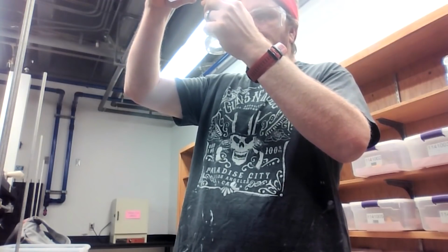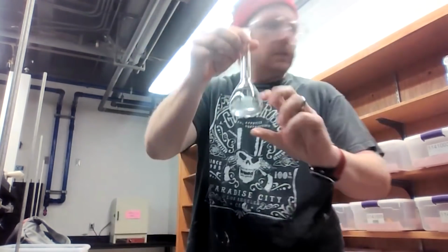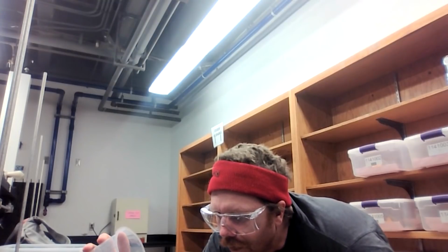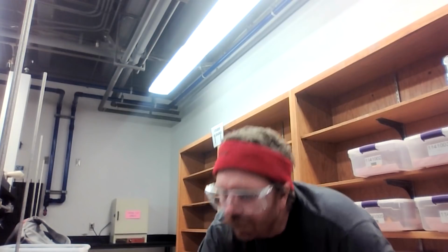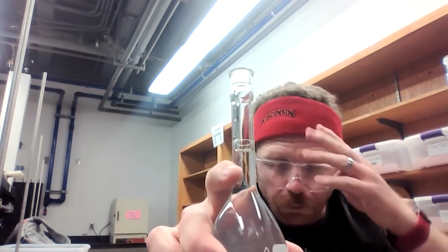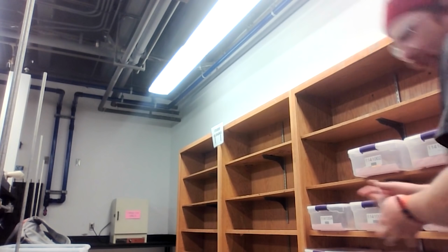Now, a volumetric flask is kind of tricky to work with because of the fact that there's this large bulb at the bottom and it takes a little while to fill that up. But then once you get, okay, now I've got my, see this etched line right here indicates 100 milliliters exactly. There's no markings on this piece of glassware outside of that. That's a very important distinction for this particular piece of glassware. It's extremely accurate so long as you use it properly.